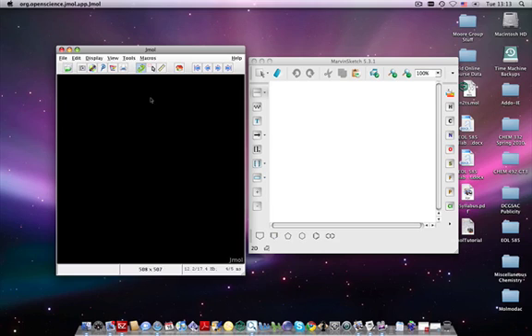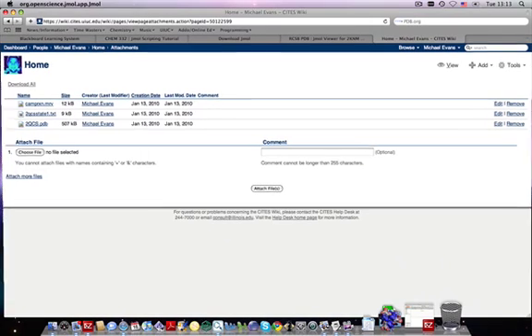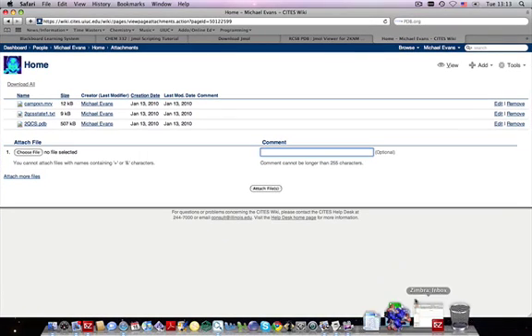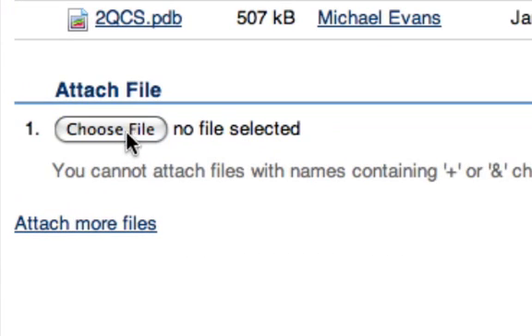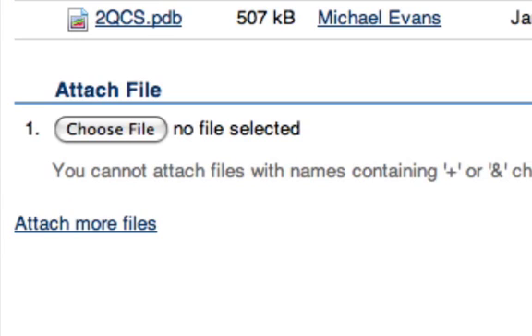So if you have a PDB in mind, the first step is to simply upload it to your wiki page as an attachment. Go to the Edit Attachments menu and you'll see something like this, click Attach File, navigate to your file, and upload it.